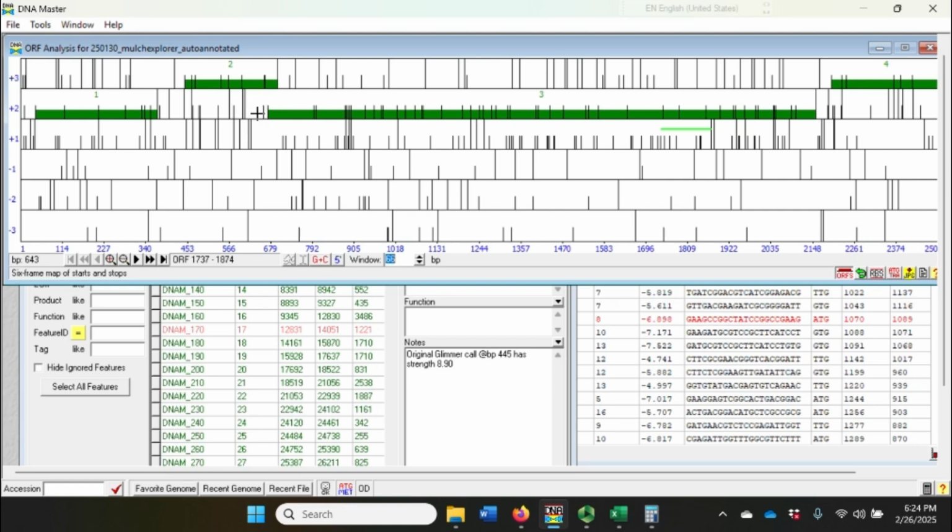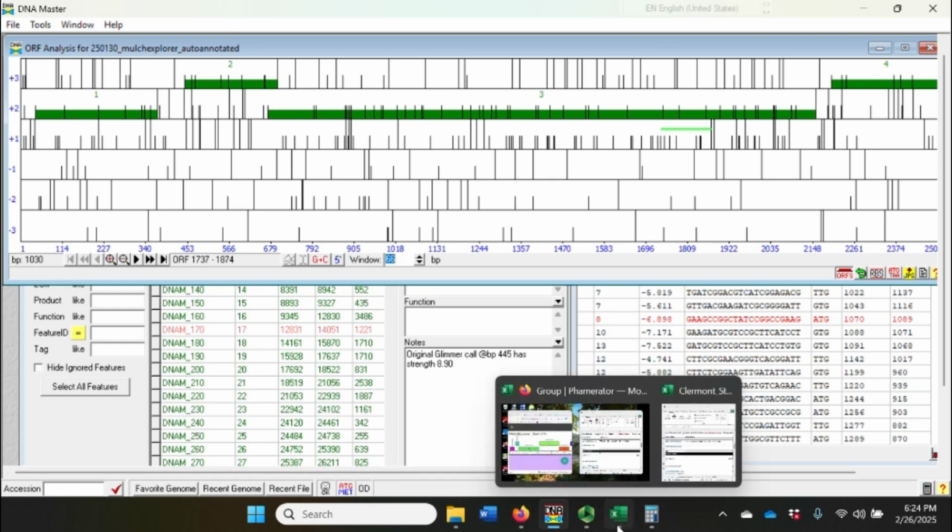Now, in my mind, once you start to have an overlap, you're going to try to minimize the overlap if you can. So there's no good reason to pick the earlier start site and just make that overlap a little bit longer than it needs to be. So this gap analysis, I think, is going to point us in the direction of picking the second of the two start sites.